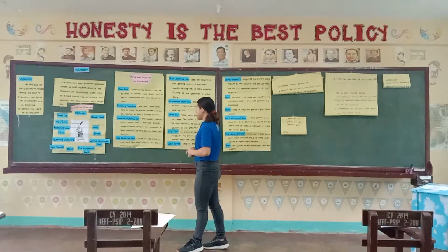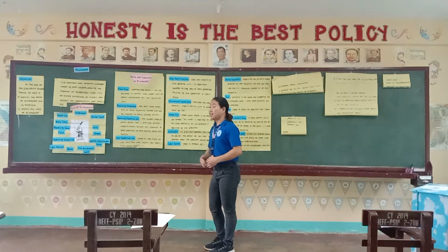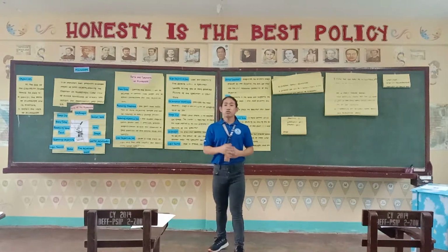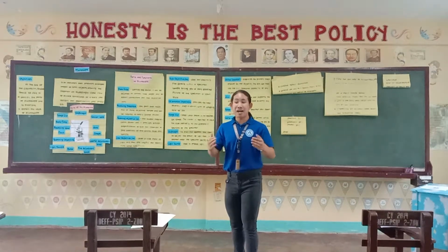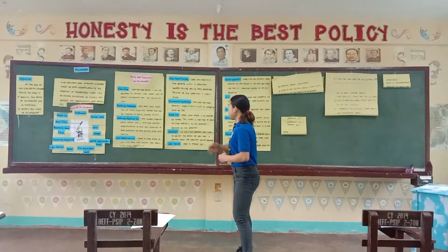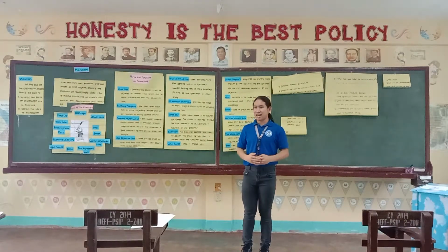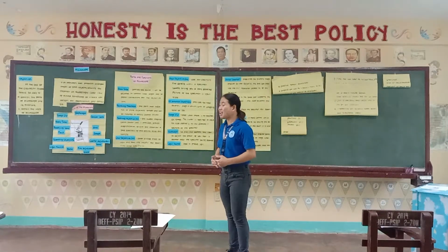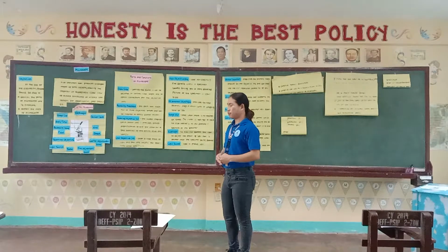The low objective magnification covers a wide field of view, and is useful for examining large specimens. Meaning to say that this low objective has 10 times power magnification. It is very useful in examining large specimens. Gamiton siya para sa mga large specimens ng mga structure.